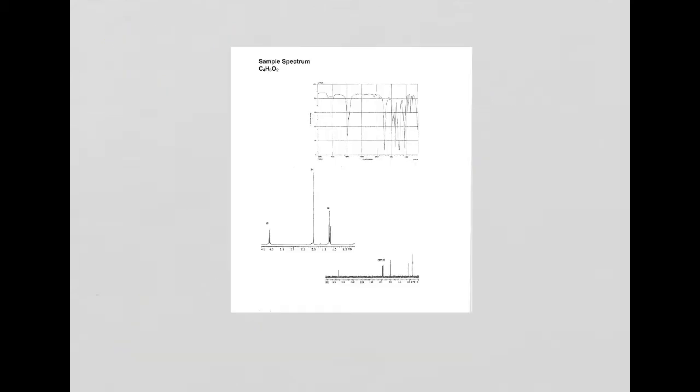Let's go back to the sample spectrum I have given you. Okay, and you knew this was IR and this was proton NMR. Now let's look at this proton NMR now that you know chemical shifts. You see 1, 2, 3 peaks. Okay, again, these are all important.